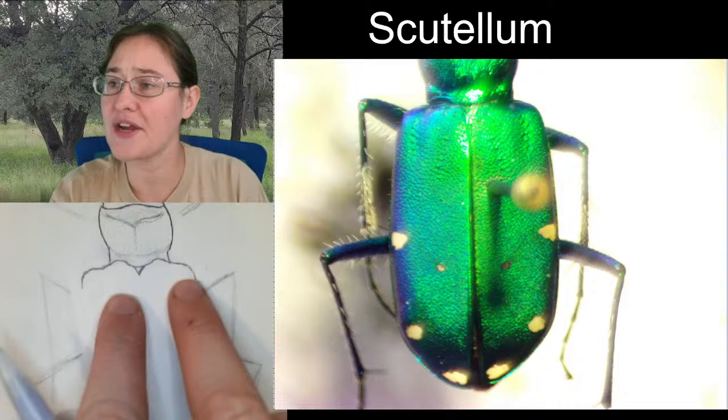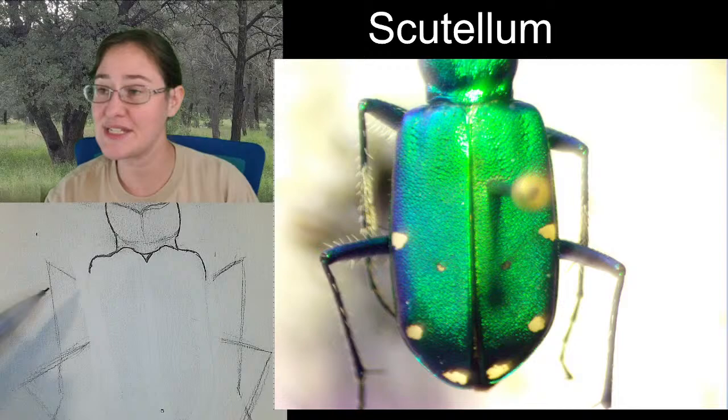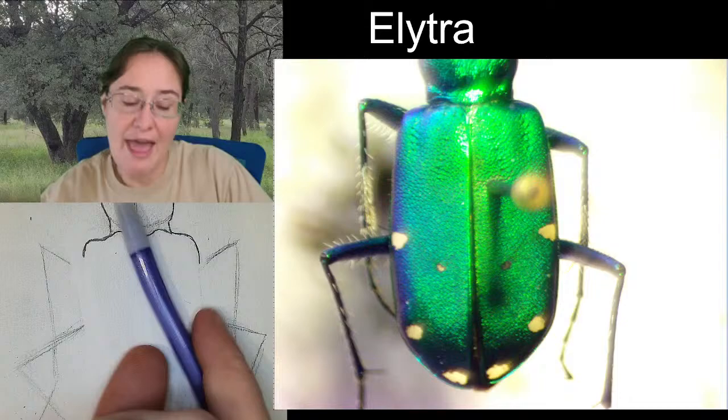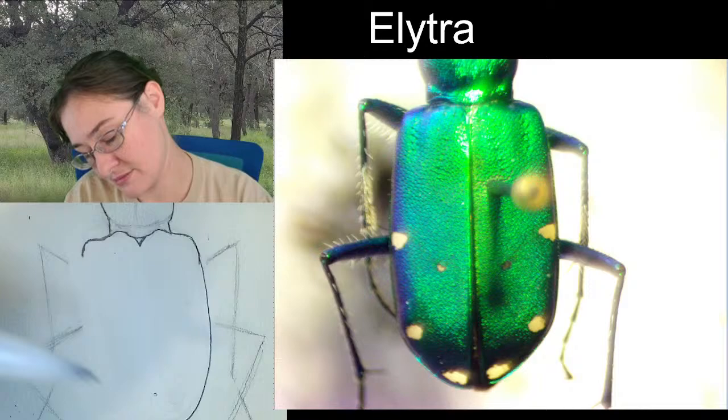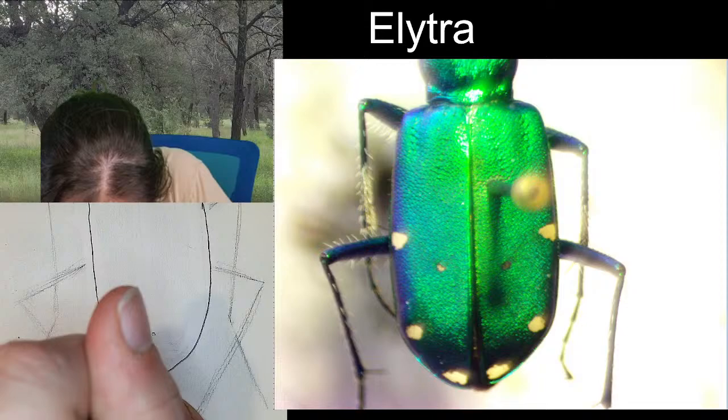All right. Our elytra do have some pretty distinctive shoulders. So when they come out from the edge here, you're also going to have these rounded edges. These are our elytra. These are our wing shells. We call them elytra. And only beetles have elytra. And our elytra are rounded all the way to the end. But then, once we get to the end, at the very center, there's going to be just a little tip of the abdomen that shows at the very, very end.